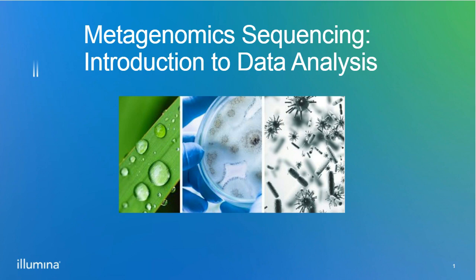My name is Vinh Pham, and I'm a software technical application scientist. Today I'm going to talk about metagenomic sequencing, an introduction to data analysis. This is the second part of our metagenomic sequencing series. I include the link in the resource slide for the first part, which is introduction to library prep and sequencing.